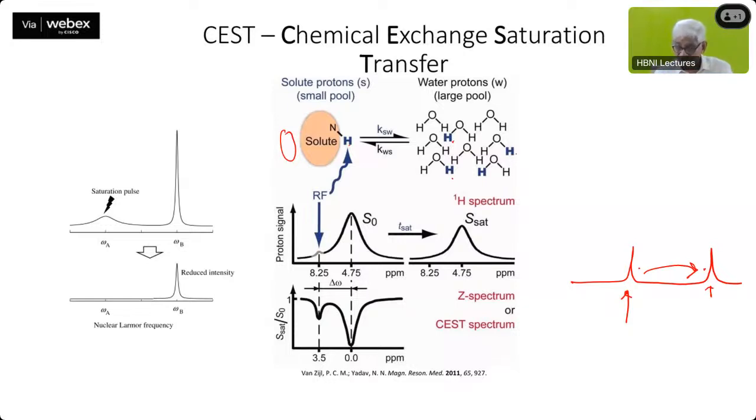That is called saturation transfer. Therefore, if I irradiate this amide proton, this NH, and this gets transferred to the water, then the water signal will go down.